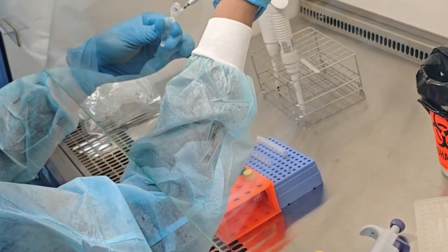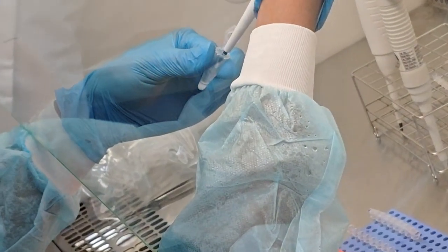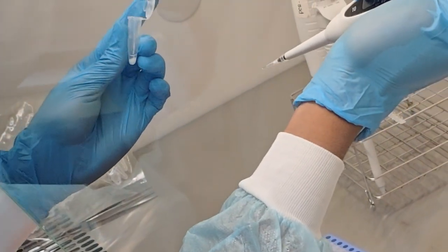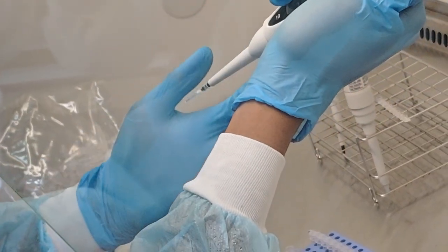Yeah, make your tip into the cylinder, but don't touch or tap. 2 microliters. And when you pack, you can use your finger to check whether you have packed the template.